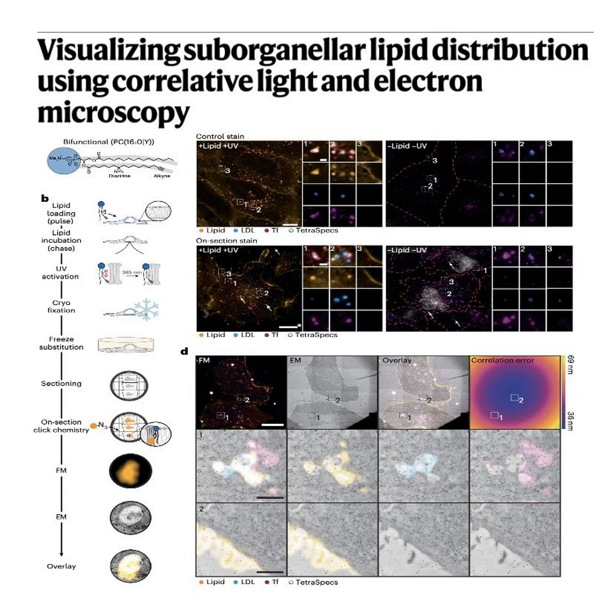And for decades, cellular biology has actually had exactly this problem when trying to map the nanoscale domains of cell membranes. It really has. I mean, we could easily see the proteins moving around like those cars, but the lipids, the fats that form the actual cellular infrastructure, they were completely invisible to us. It's just wild to think about, and that is exactly what our deep dive is about today. We are unpacking this incredibly dense, revolutionary technical report from Nature Cell Biology. And it introduces a workflow called Lipid-CLEM, right? Which stands for correlative light and electron microscopy.